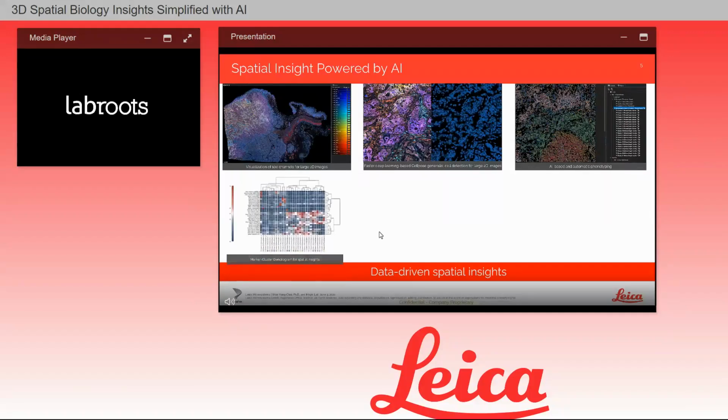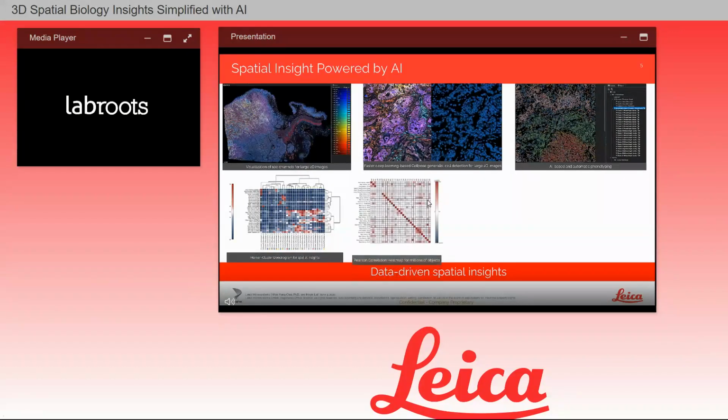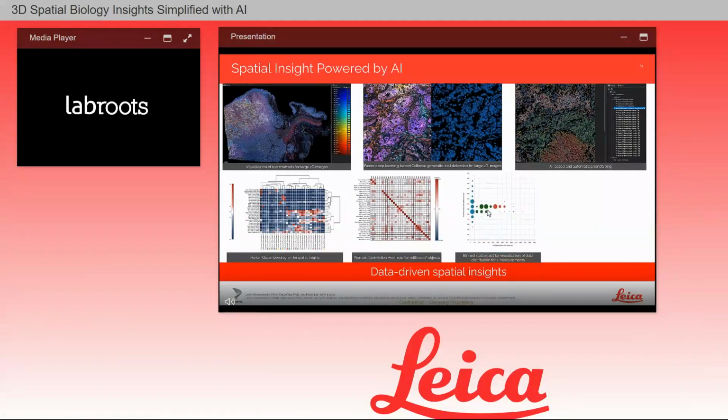In addition, we introduced a number of interpretation tools, such as this marker cluster dendrogram for spatial insights, Pearson correlation heat map for millions of objects, bin scatter plot for visualization of data distribution for 2 different measurements, and dimensionality reduction for fast exploration of high-dimensional data.